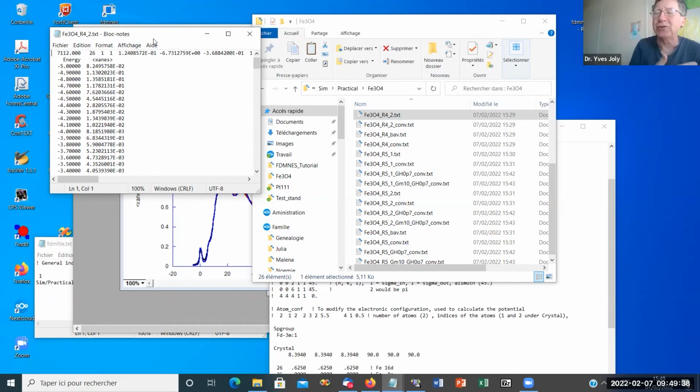So it's rather artificial, I mean. From the calculation point of view, it's difficult to perfectly fit something which is rather artificial in the definition of the experiment. So this means that you nearly always will have to make a shift between the experiment and the simulation.